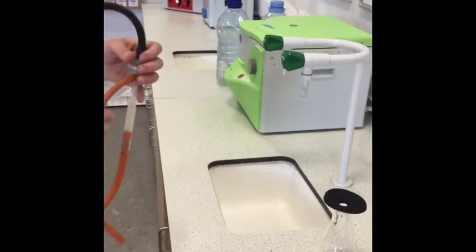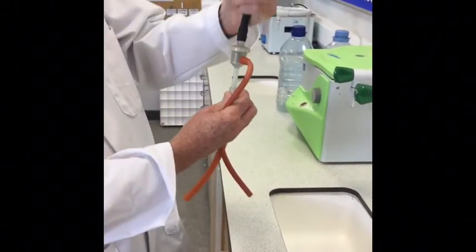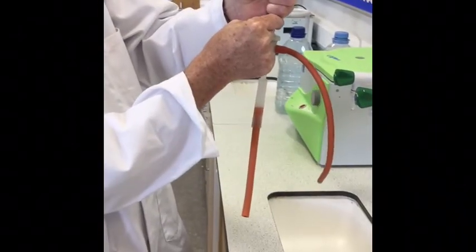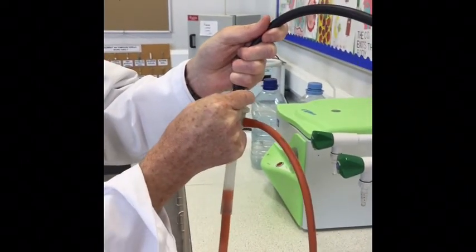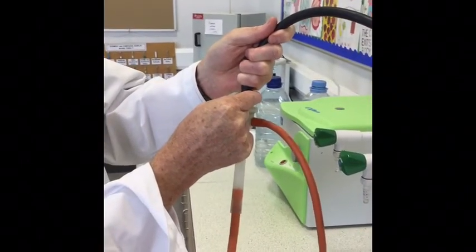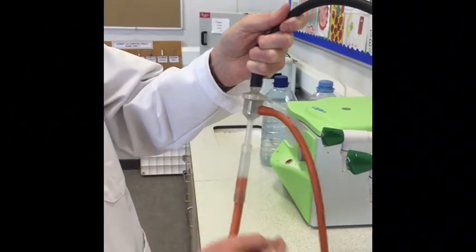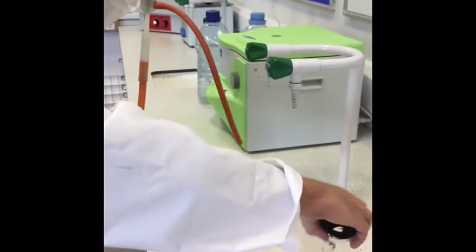Okay, so this is a water pump. In this part here you've got a thick pipe up here and a thin pipe here. The thick pipe is what gets attached to the tap. And as the water flows through here, it produces a vacuum here which you attach to this Buchner flask.